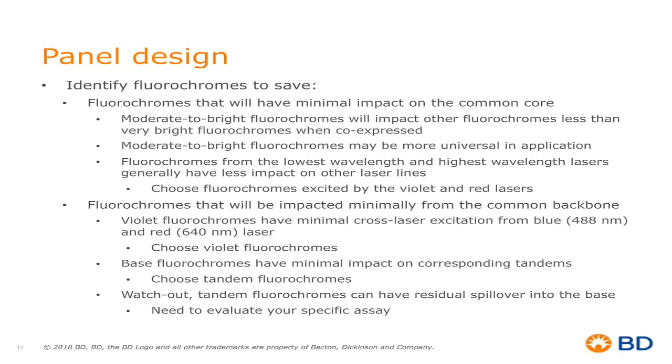This would be an example of PE and PE-Cy7. PE-Cy7 will have some spillover into the PE channel, and this could lead to some loss of resolution in PE. So we need to evaluate this in our specific assay. And of course, we need to evaluate the impact of our drop-ins, specifically our drop-in panel, on the backbone panel. So let's get started on some panel design.